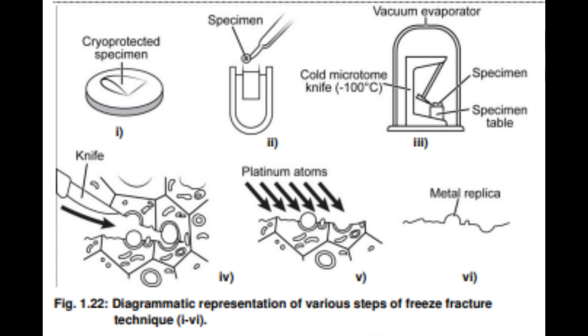1.4.3 Freeze etching. The freeze etching technique of sample preparation is related to freeze fracture. One more step is added to the freeze fracture procedure. In this method, the specimens are rapidly frozen in liquid freon under vacuum and struck with a sharp knife edge as in the freeze fracture method. Biological samples fracture along lines of natural weakness at low temperature.